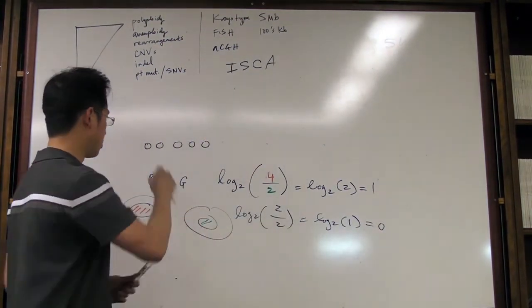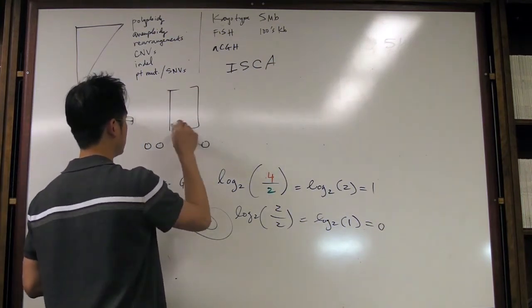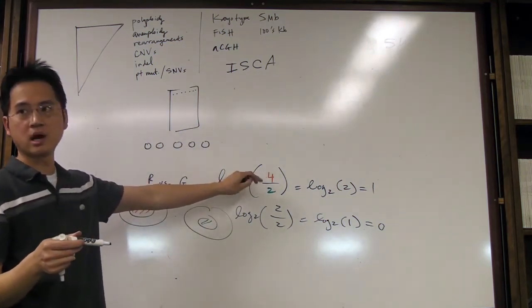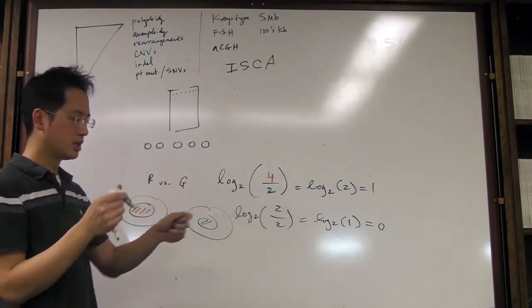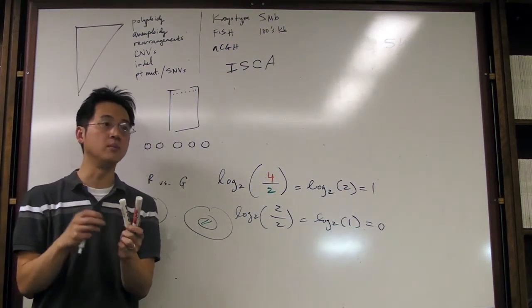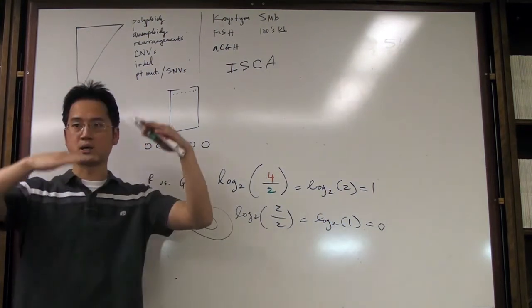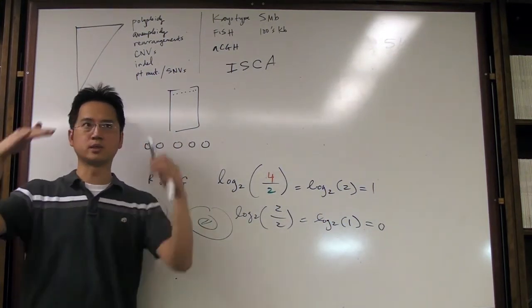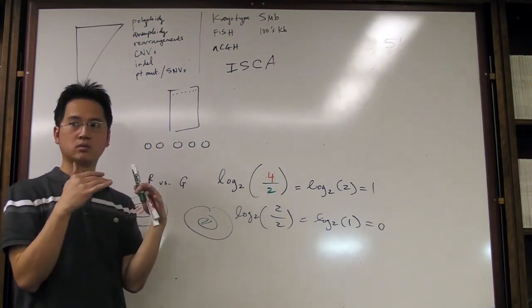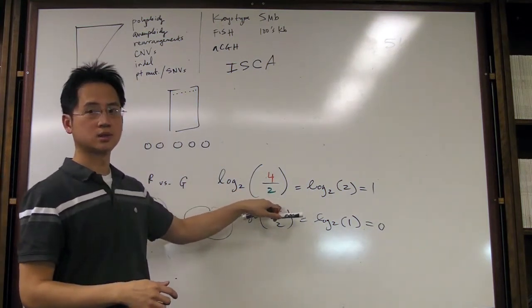So what we do is we go through each spot on the array, and here's the array again. You just go through each spot, and you just count how many red signals do you have, how many green signals do I have. The intensities between the two are going to be a little bit different. Green may be a little bit brighter than the red, for example. So the computer will know to normalize that based on looking at all the probes. It's going to normalize it back down between the red and the green and make it a little bit more equal and more like each other in terms of intensity. And then you do this ratio business.